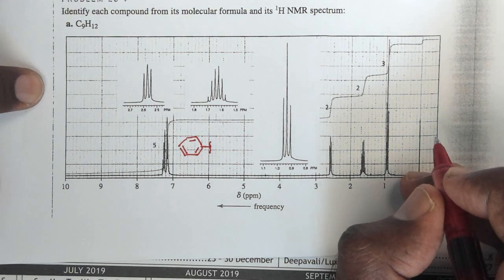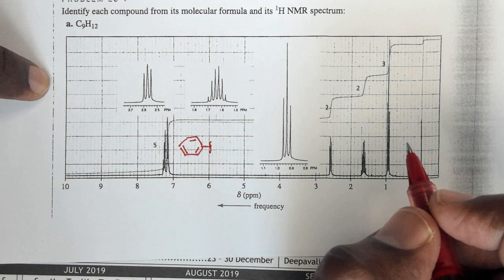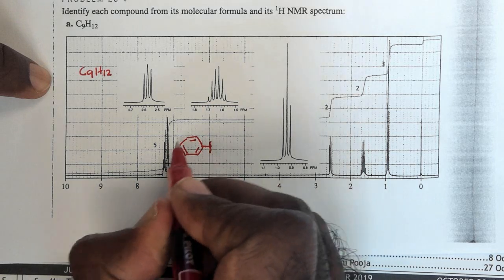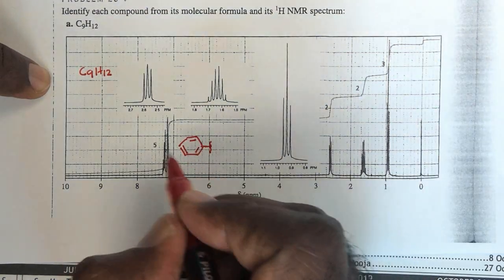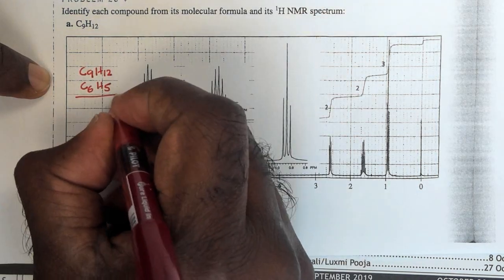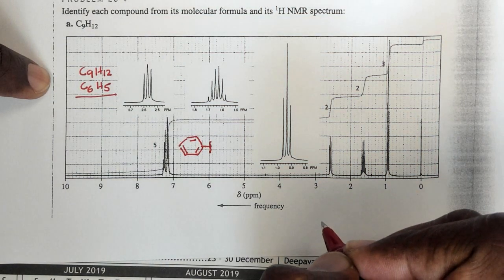I quickly want to go from there to the molecular formula and subtract what I've done from the molecular formula, because this is quite a sizable chunk from the molecular formula. And if I look at this, I have a C6H5 fragment that I've actually taken from the molecular formula of the compound.